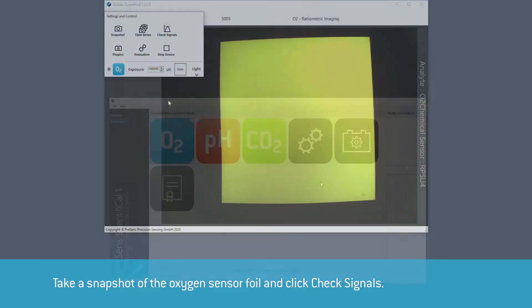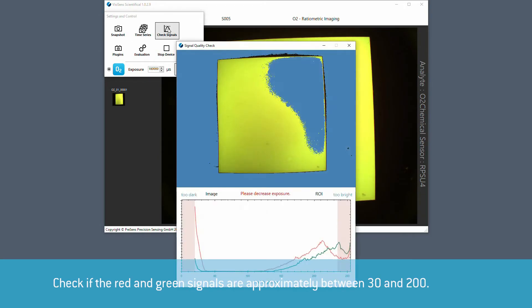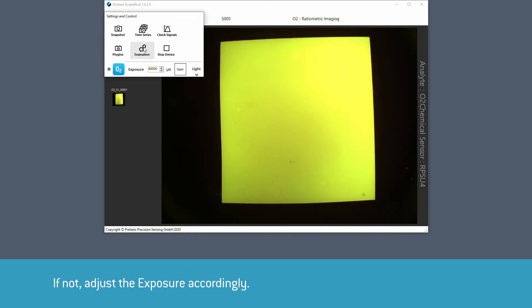Take a snapshot of the oxygen sensor foil and click check signals. Check if the red and green signals are approximately between 30 and 200 in the graph that opens. If not, adjust the exposure accordingly.